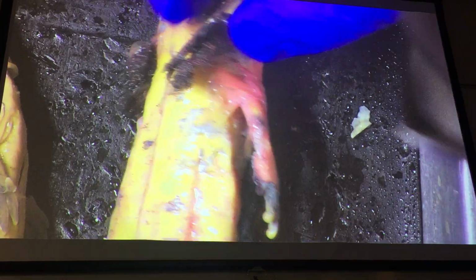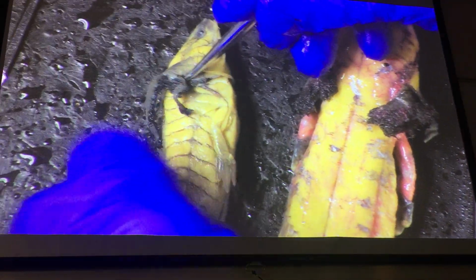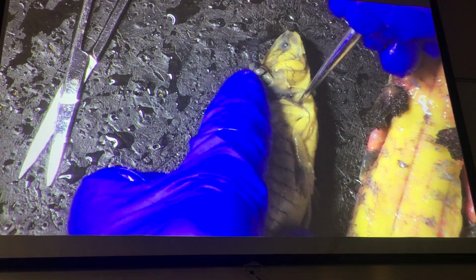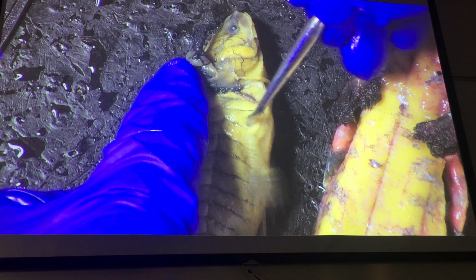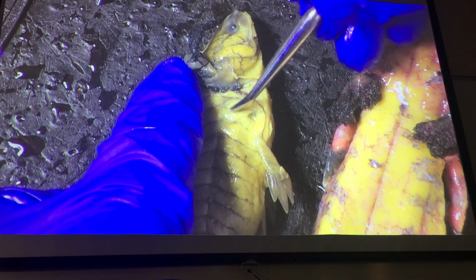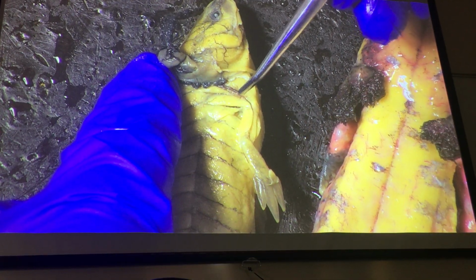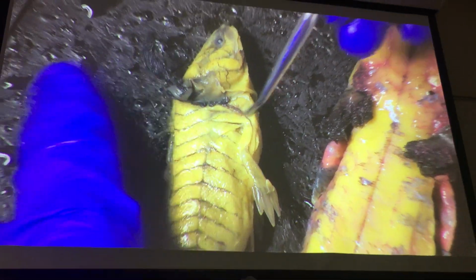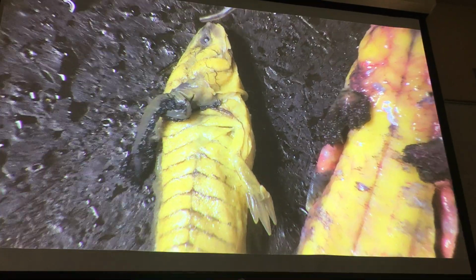But when you look at it on your tiger salamander, these guys are more muscular in some ways. So we look at it here, cucullaris, dorsalis scapulae, latissimus dorsi, really showing off well. So either one could be used, but this one really looks nice in terms of making it easy for you to see on the dissection practically.